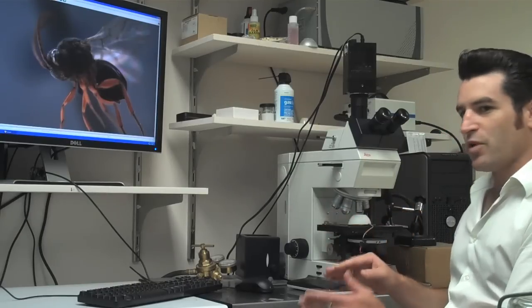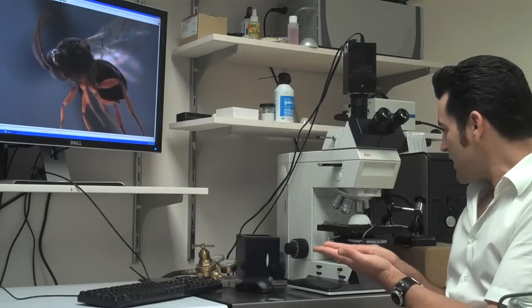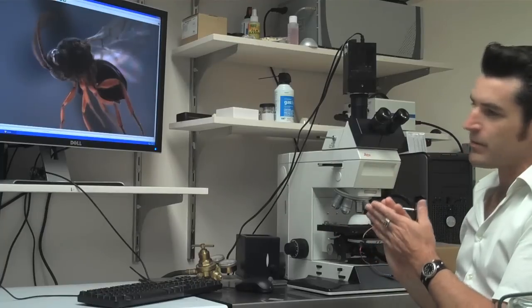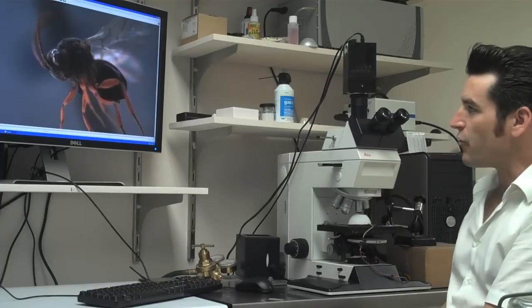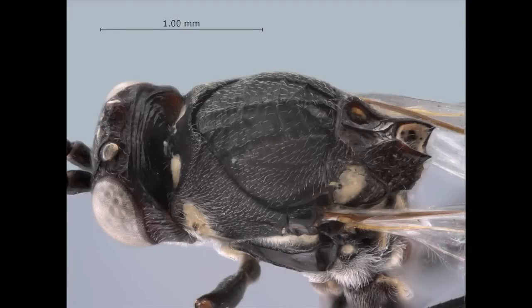What we're doing is actually putting a whole specimen still on its pin underneath those same lenses and using a different kind of camera system, but very much analogous to the other system we used before. We're able to get images that are several times more resolved than the other system.